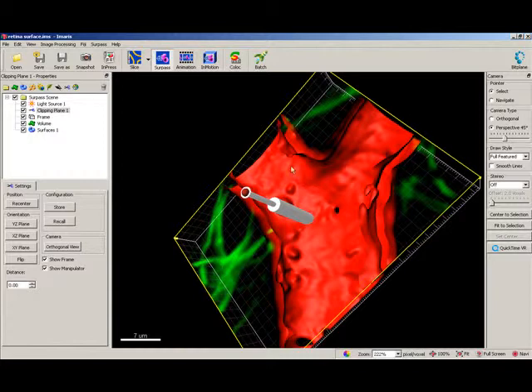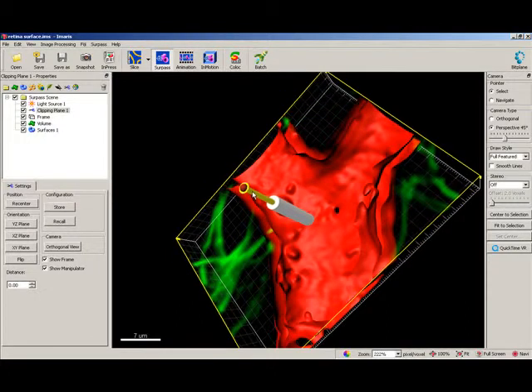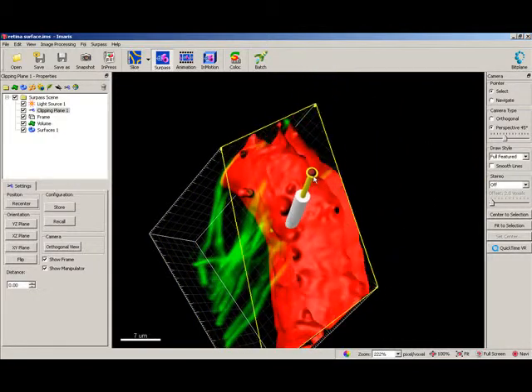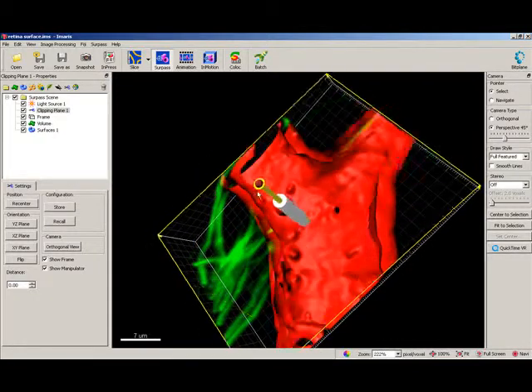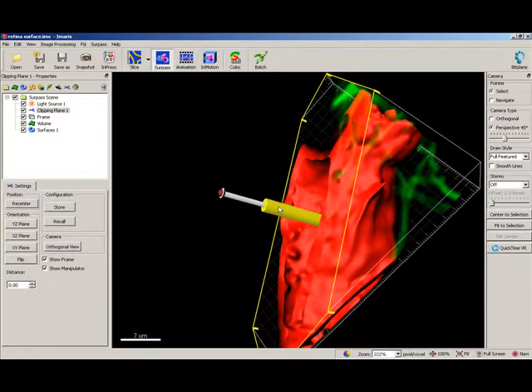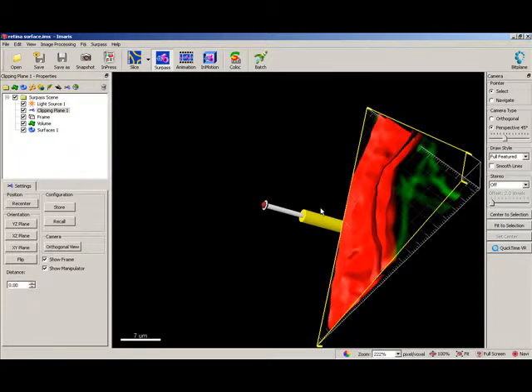To freely rotate the clipping plane, click and drag on the thinner spindle. The spindle is automatically highlighted, and you can freely rotate the clipping plane by moving the spindle with your mouse. By selecting the thicker spindle and moving it, you can adjust the position of the clipping plane within the image.